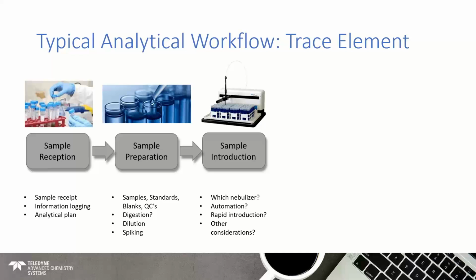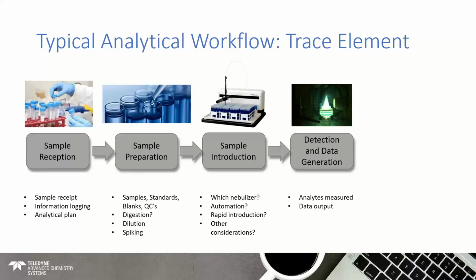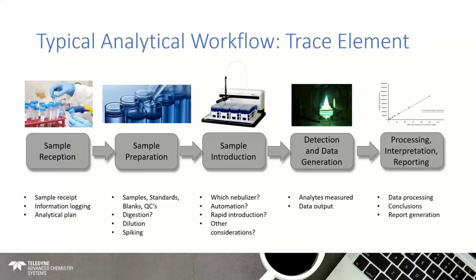So we've introduced our samples. They move on into our ICP, one at a time, obviously, where we break down our liquid samples, we atomize, we ionize, we detect those ions, or we have photon emission in the case of optical emission, and we generate our data. That data is then output to some sort of system and collected, and then we move on to processing, interpretation, and reporting on that data. So that's our whole workflow.